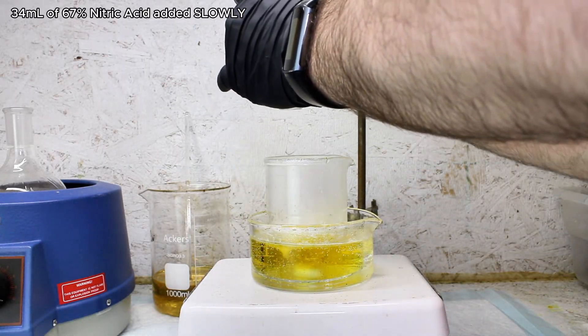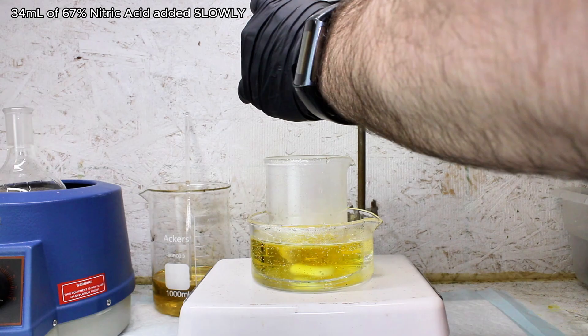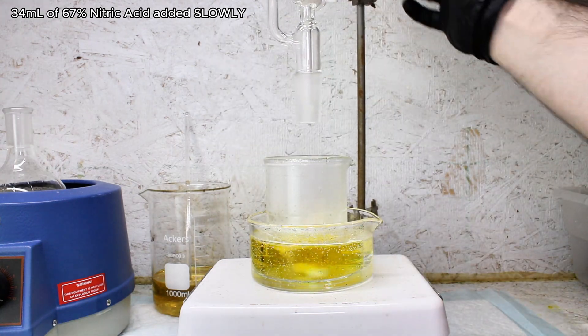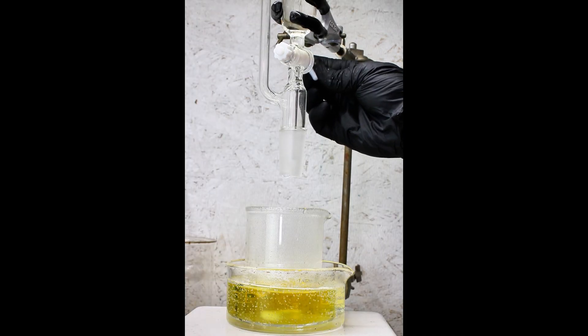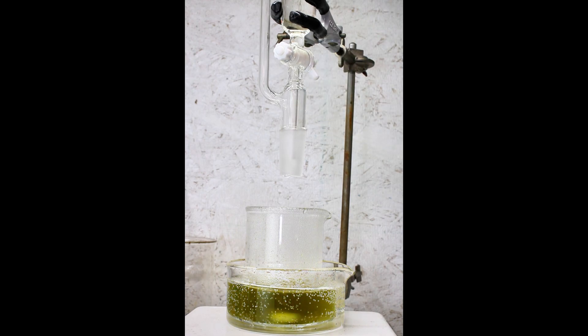Next, I slowly added 34 milliliters of 67% nitric acid using an addition funnel. This immediately caused the solution to turn green, which turned darker over time, and by the time all of the nitric acid had been added, the solution was a very dark and indiscernible color.